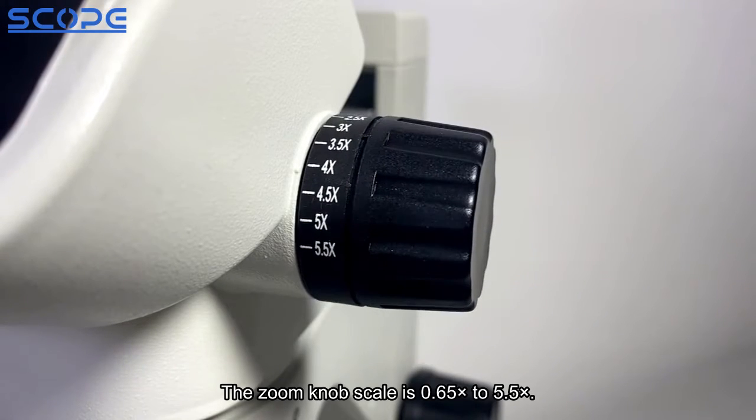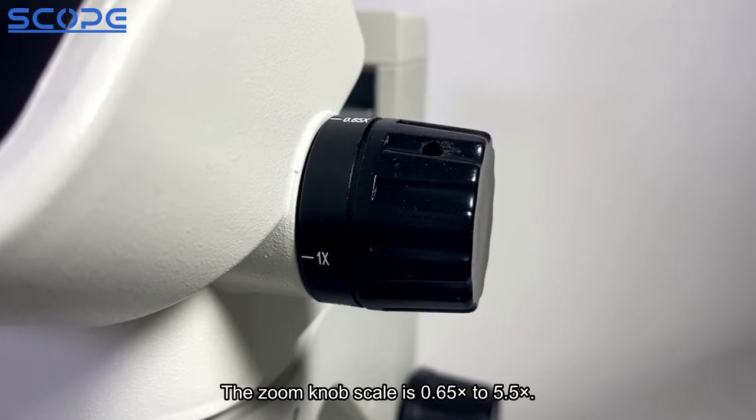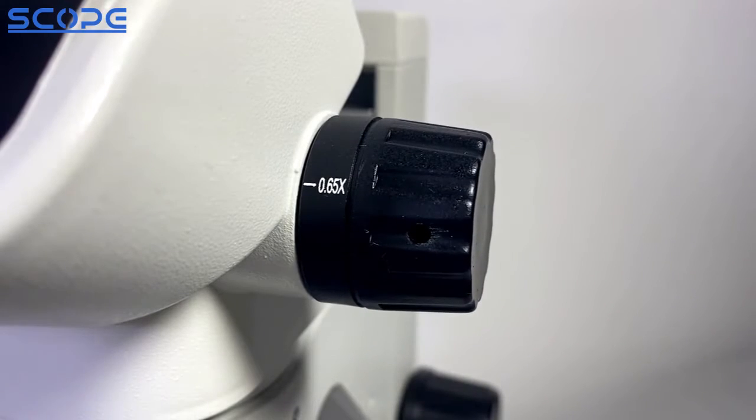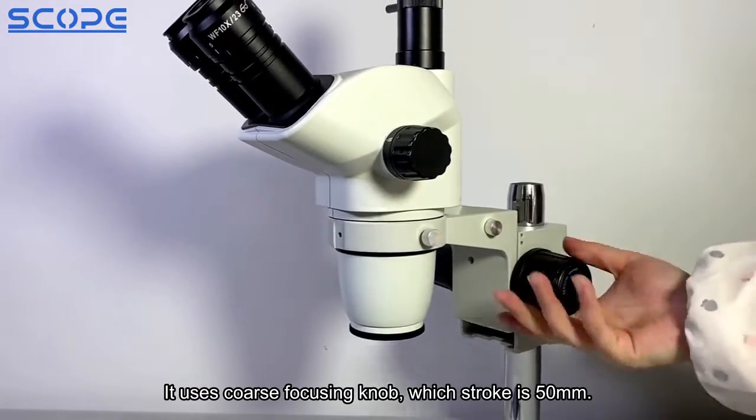The zoom knob scale is 0.65x to 5.5x. It uses a coarse focusing knob with a stroke of 50mm.